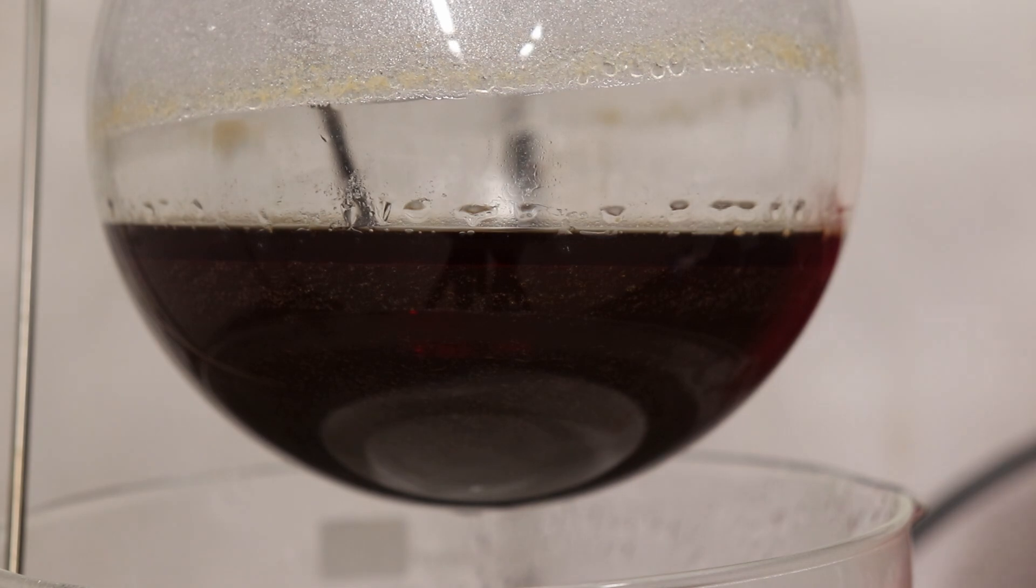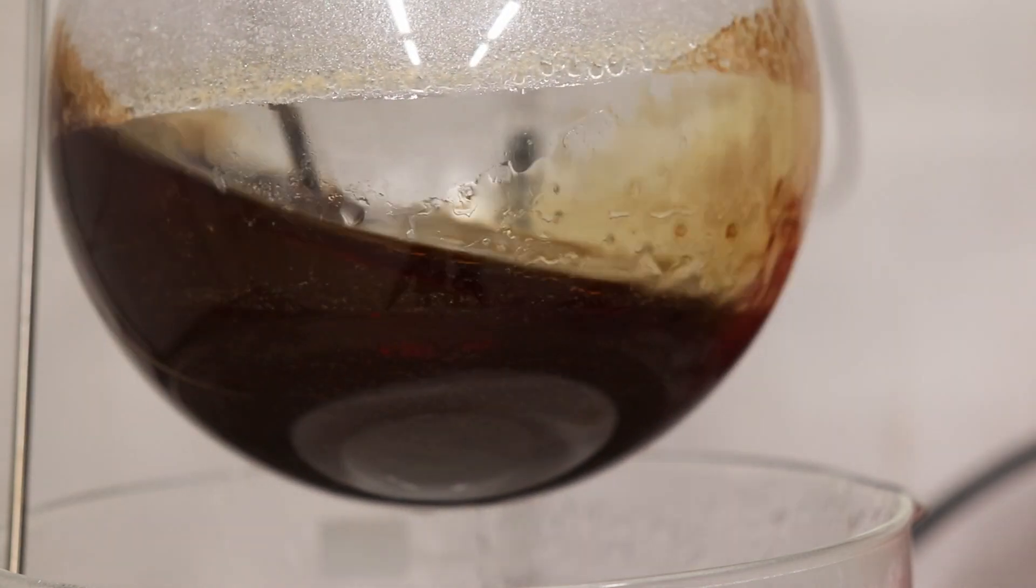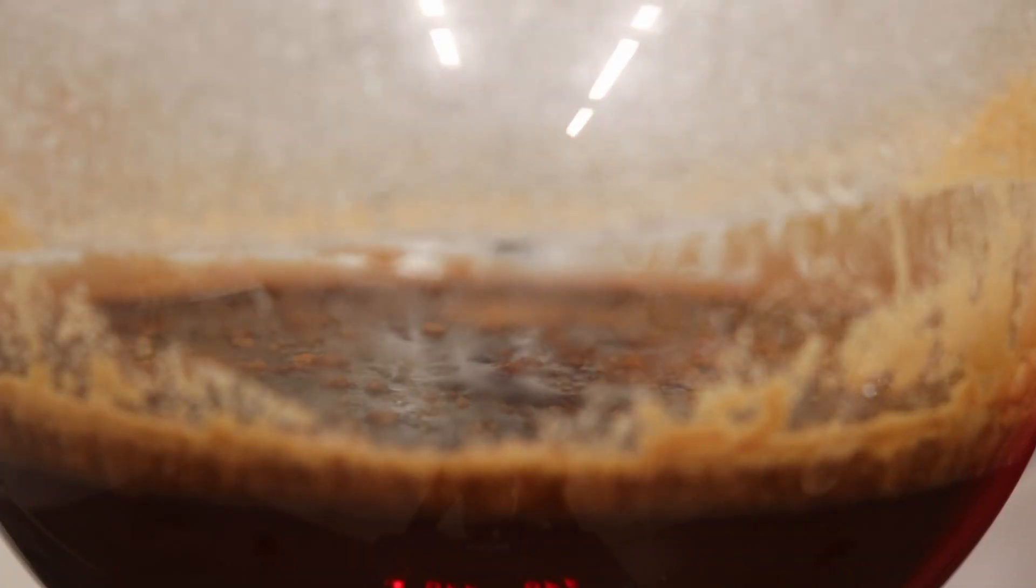Here you can see the lower aqueous layer and upper molten 2-methoxynaphthalene layer, as well as the film of crystalline 2-methoxynaphthalene deposited on the walls of the flask. The mixture was then allowed to cool to room temperature, which caused the 2-methoxynaphthalene layer to solidify in the flask.